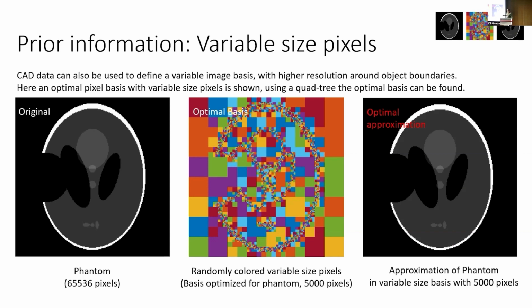If we take, again, our simple image, here in the middle I just show the voxel basis, and I assigned random colors to each voxel, just to show you roughly the variation. So we have big voxels, and all these voxels, pixels actually, are square. Just a random assignment here gave me colors that look very similar. They're all square voxels, but depending on where we need higher resolution at edges, we just have more of them, finer, smaller voxels.